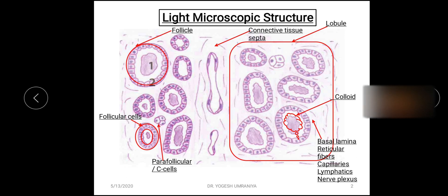Two types of cells are found in the thyroid gland. First, we have already seen the follicular cells. Apart from these, there are parafollicular cells — the pale-stained cells seen here — known as the parafollicular or C cells. Their location is between the follicular cell and the basal lamina, as well as in clusters within the connective tissue. Another name for parafollicular cells is clear cells. These cells produce the hormone known as calcitonin.